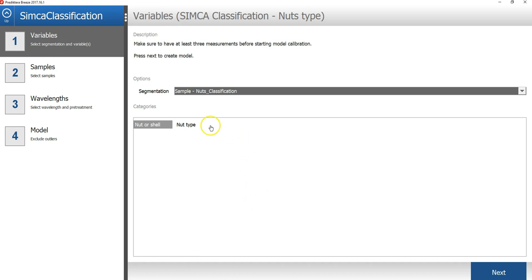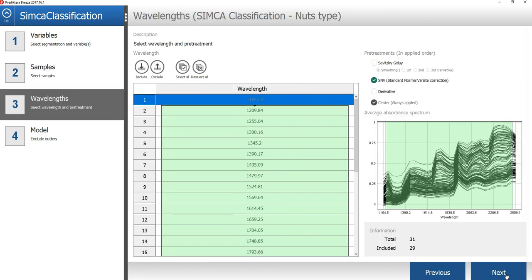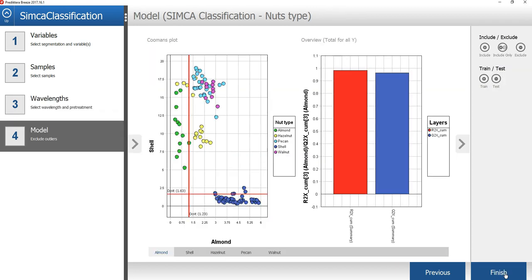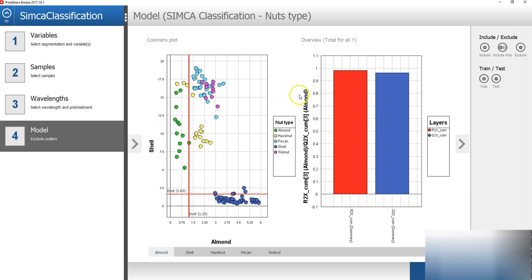In the classification wizard, I will first select the nut type variable. In the next tab of the wizard, I will just press next, and then next again. In the Simca method, one PCA model is created for each class. The overview graph is showing you how much of the variation is explained by the Simca model. A sample is then compared to each class model to determine if it belongs to that class or not.